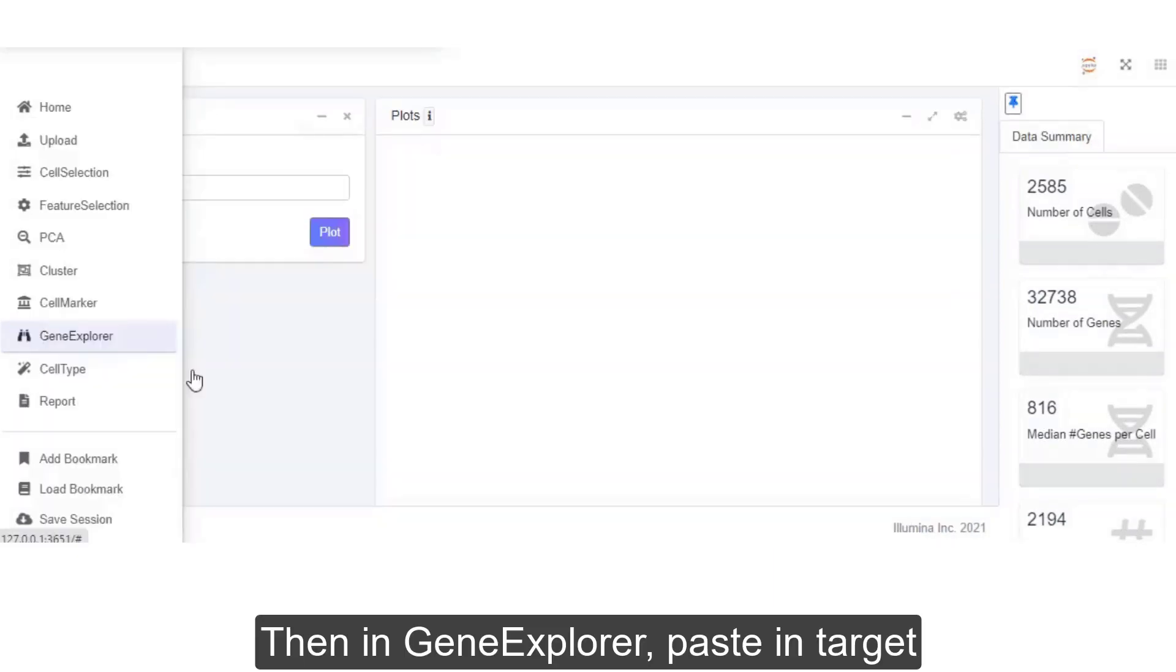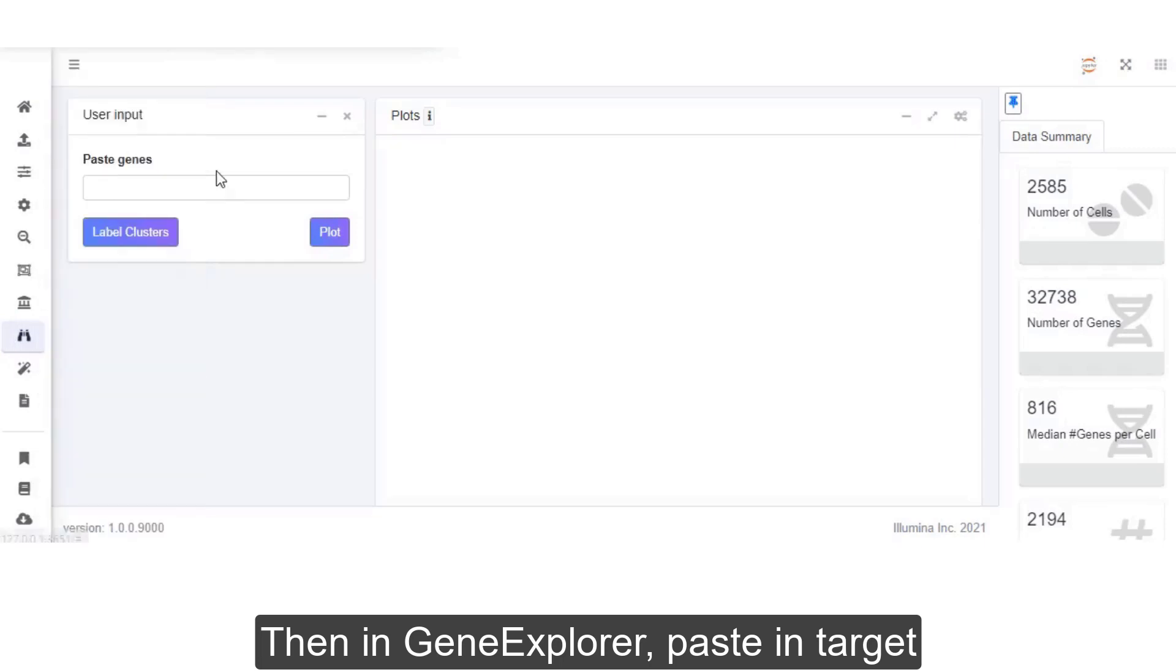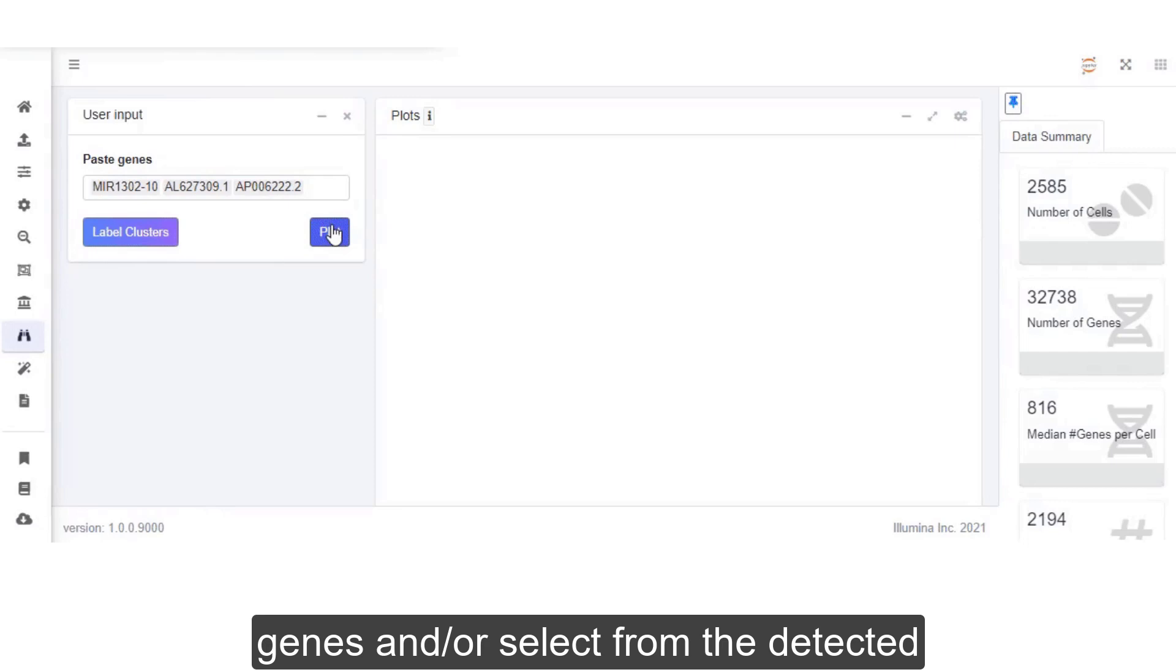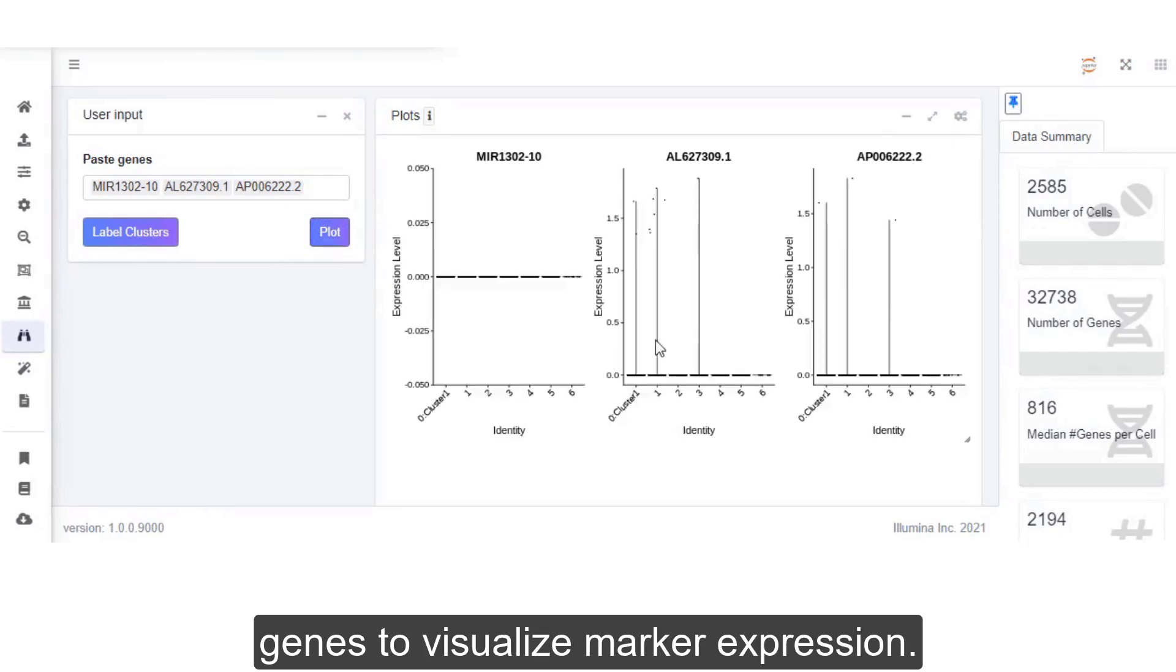Then, in Gene Explorer, paste in target genes and/or select from the detected genes to visualize marker expression.